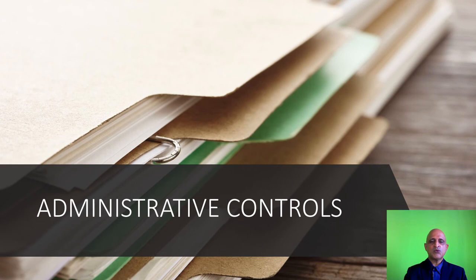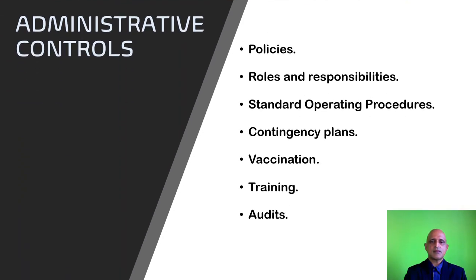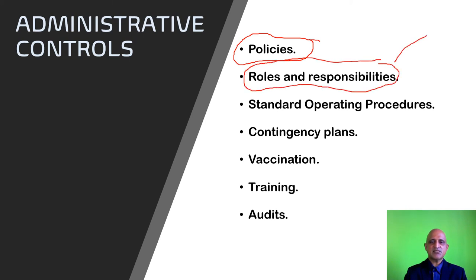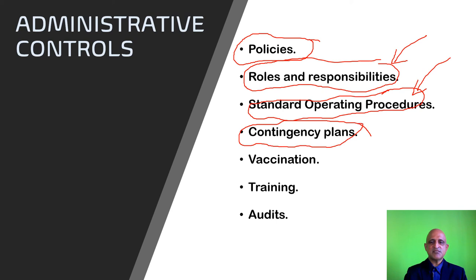We now move on to administrative controls, which comprise the policies as well as the laboratory biorisk management system. These include policies, roles and responsibilities as defined in the laboratory biorisk management manual, standard operating procedures (which are very important and will be discussed in a separate lecture), contingency plans addressing emergencies, vaccination of personnel, training of personnel, and audits which form part of your performance assessment.